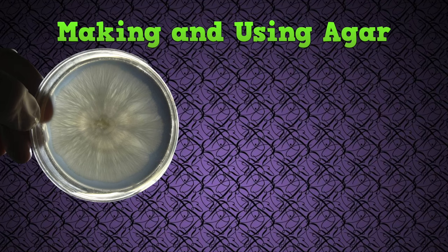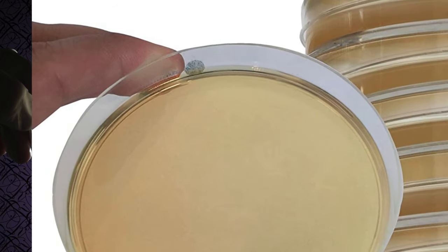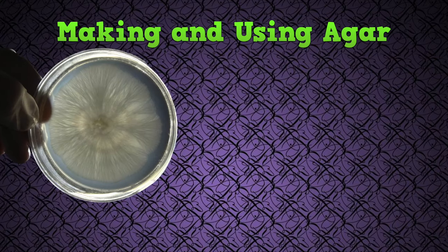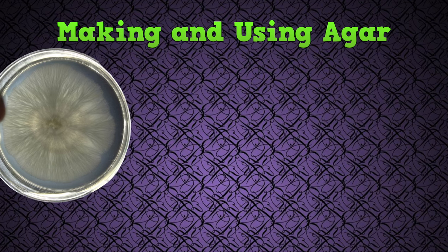So back on topic, we need to talk about agar. In this video I will show you how to make your own. It is possible to buy pre-poured dishes but when you look at the reviews these are often not sterile and just a waste of time and money. You should learn to make your own. You can save a little bit of time by getting pre-mixed malt extract agar where all you have to do is add hot water, but you get the most bang for your buck just mixing it yourself.